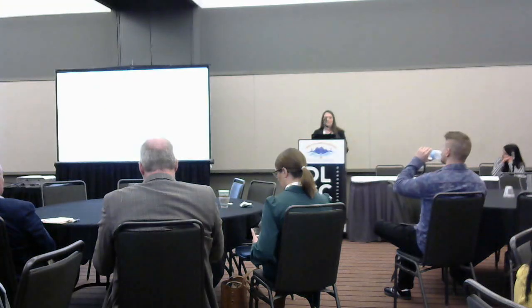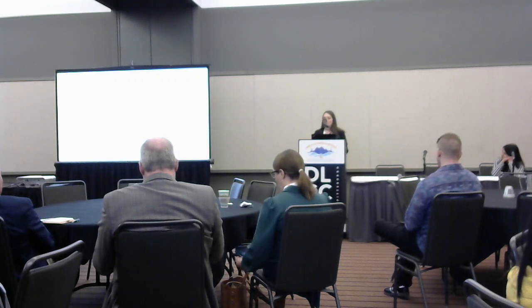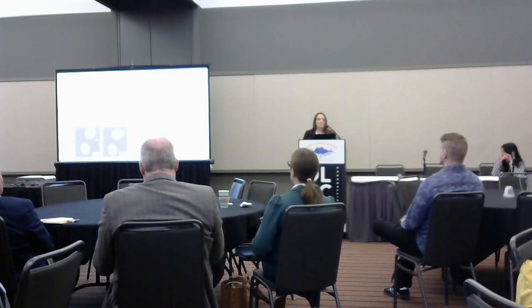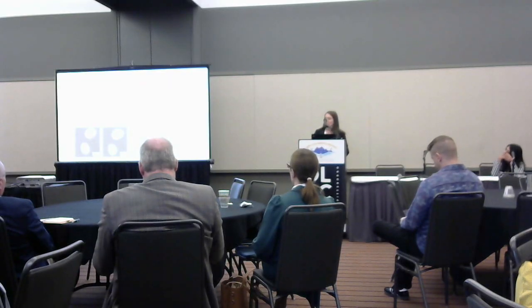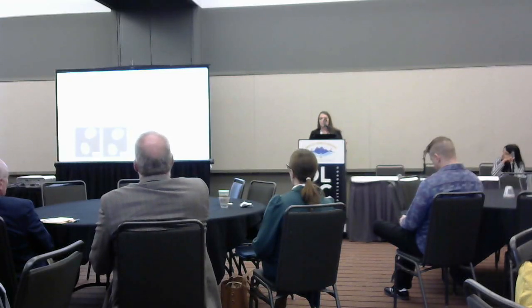So your choice of microscope, for example, can impact things like resolution of your images. Resolution can then impact your ability to identify and count objects. So if we are imaging nuclei, for example, we have this high resolution example of nuclei imaging, as well as a lower resolution example. From both of these, you can collect the same data if you are simply trying to count the number of nuclei.